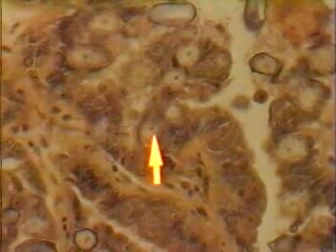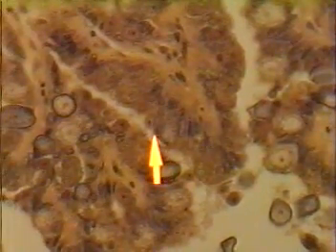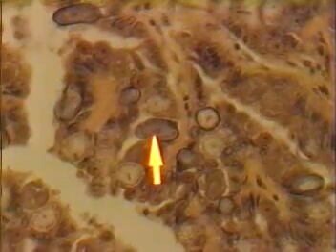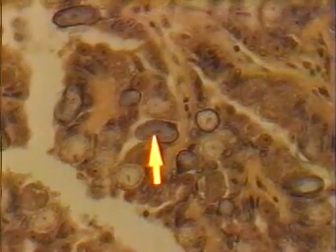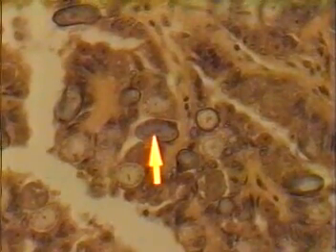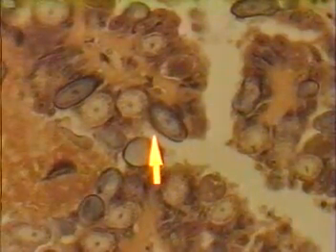unfertilized macrogametocytes here. After the macrogametocyte becomes fertilized, it will start to lay down that oocyst wall through those globules that are surrounding the outside, and eventually then dumping out into the lumen of the bile duct and traveling on down.